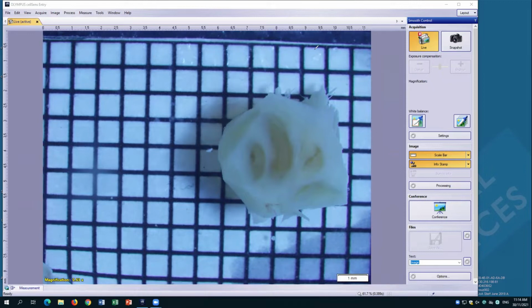So the first thing that we typically do, if we, for example, want to look at the cochlea, is trim the bone away as much as possible. And bone's been trimmed away here because bone's been softened using a solution called EDTA. Now that's a buffer which chelates calcium. So what happens is that calcium over time dissolves into the buffer, gets chelated by EDTA. So more calcium just keeps on dissolving out.